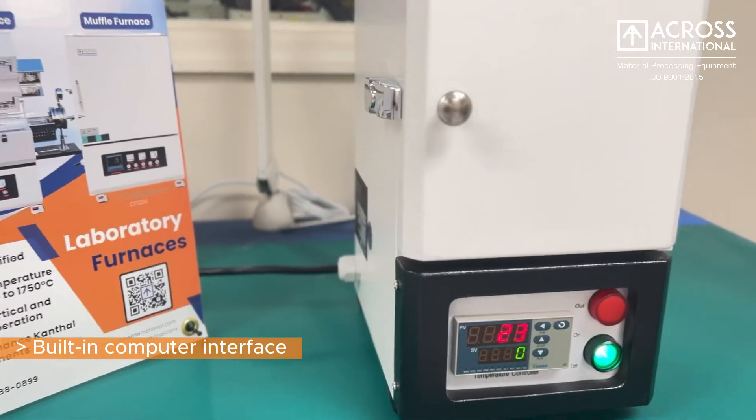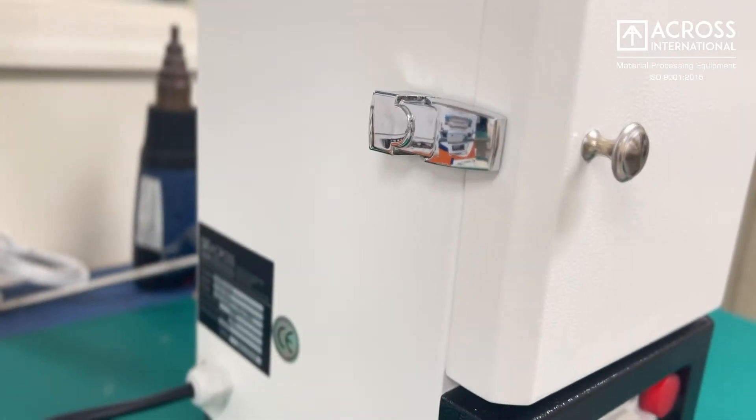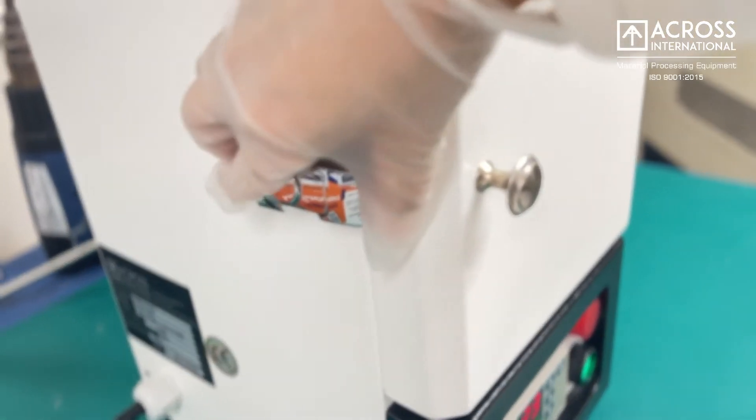Our compact furnace is small and lightweight, perfect for fitting in a glove box or limited bench space.